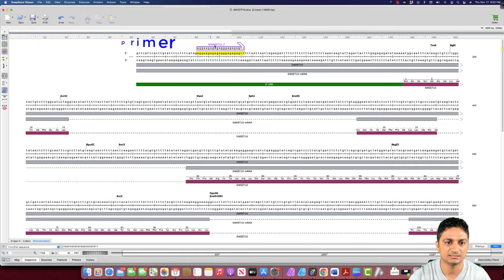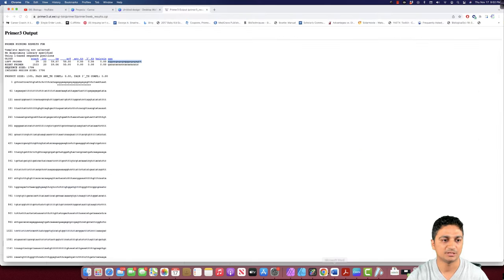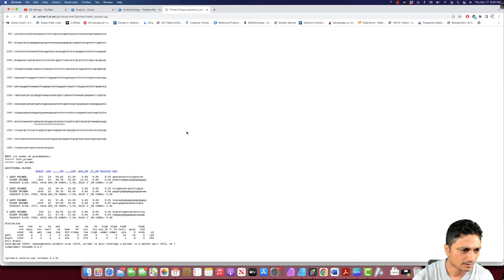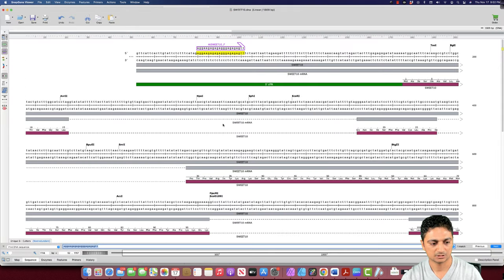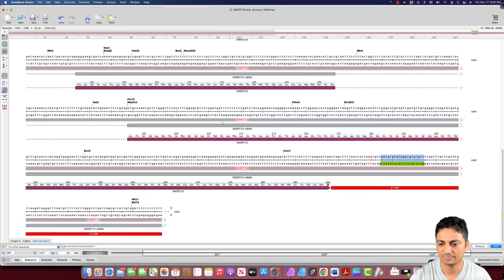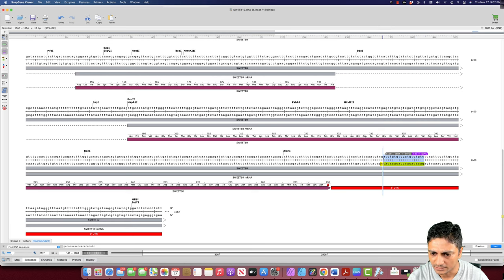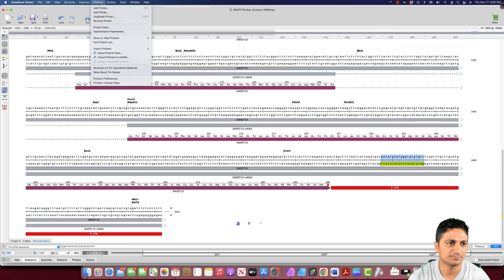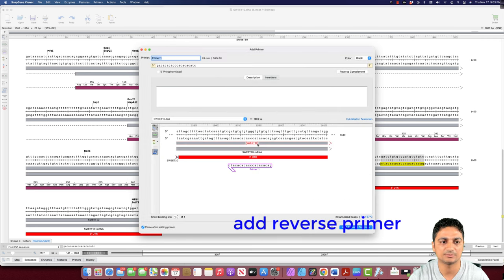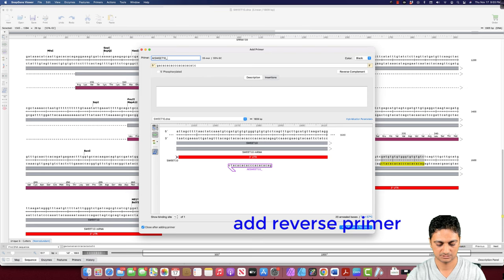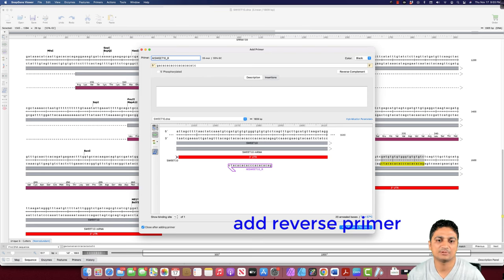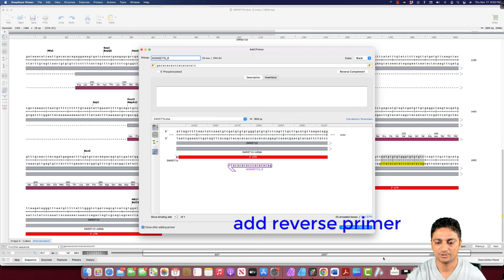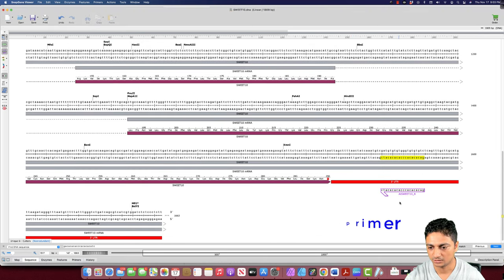Now we can see the AT switch 10 F primer is copied here. Now I'm going to copy the reverse primer sequence. Go to SnapGene viewer. Control F, Control V. We paste the primer. This is in the reverse sequence on the bottom strand. Go to primer, add primer. This is the bottom strand because this is going to be the reverse primer. I give the name AT switch 10 reverse primer. Sometime a single set of primer may not work for PCR, so we design two or three pairs so that at least one of the pairs is going to work. I'm going to add the primer to the template. Now we see our reverse primer is here.